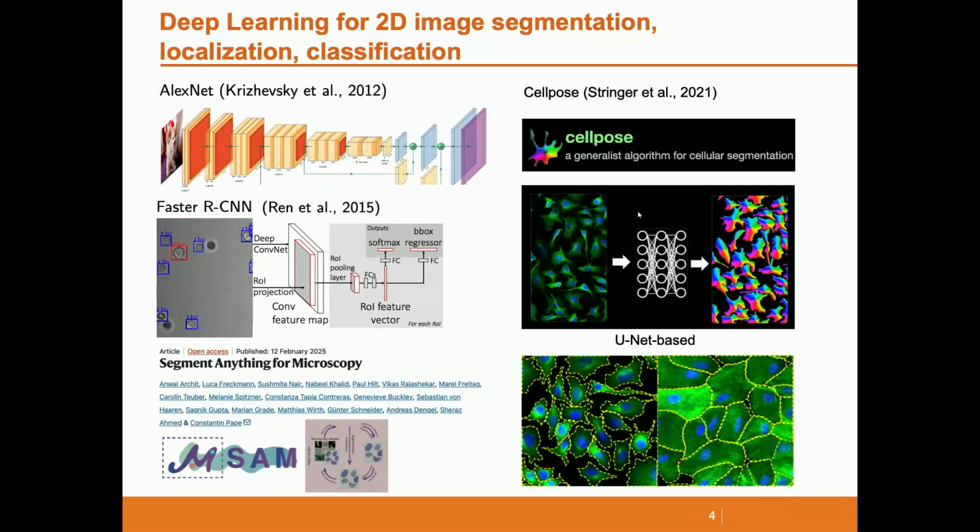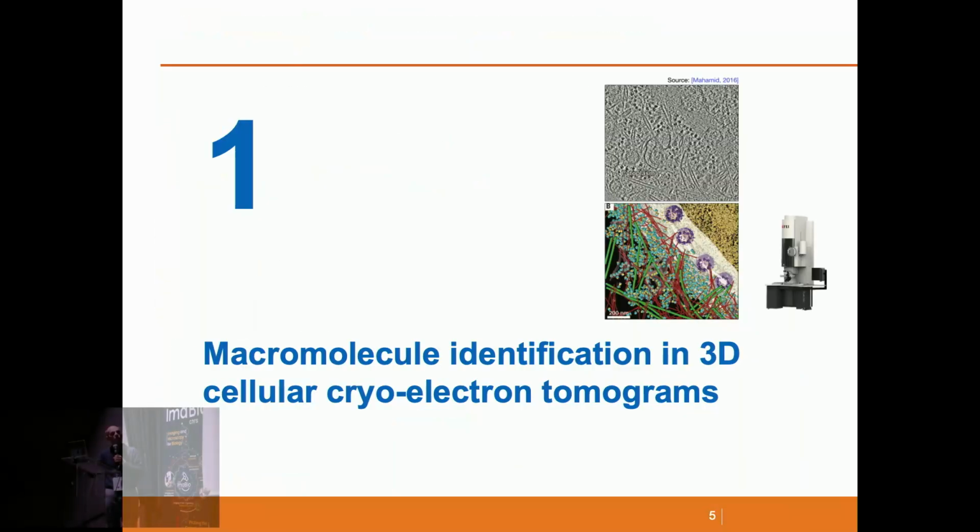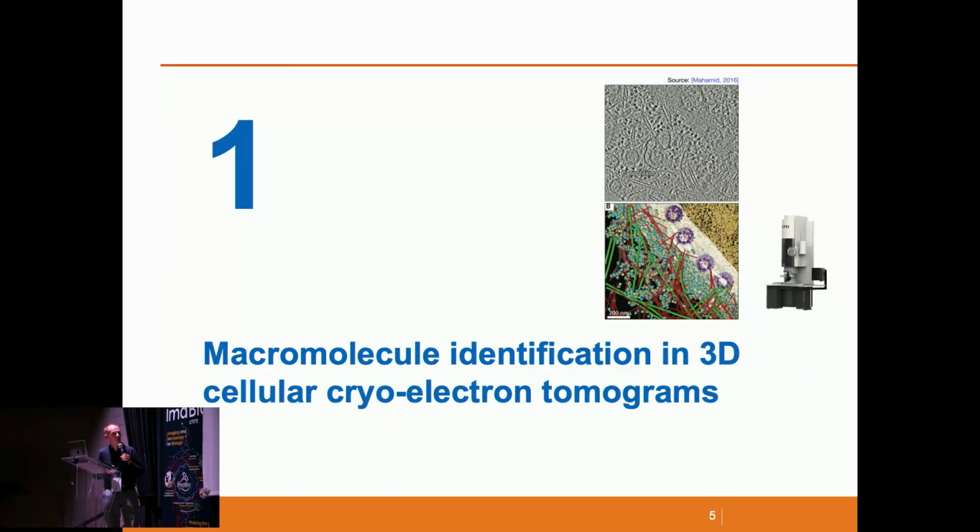So these methodologies were very successful to segment 2D images, but there are not so many tools for 3D image analysis.